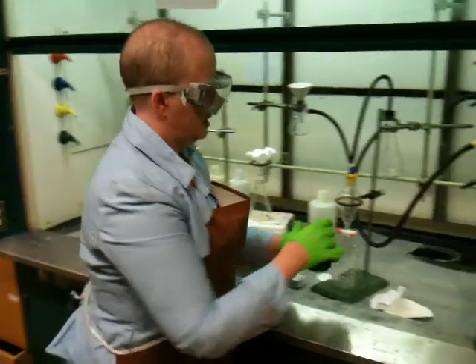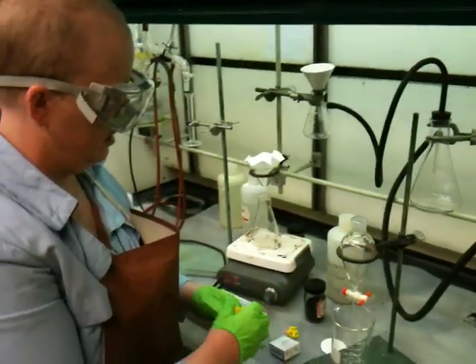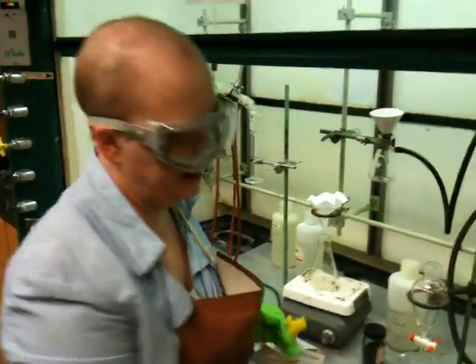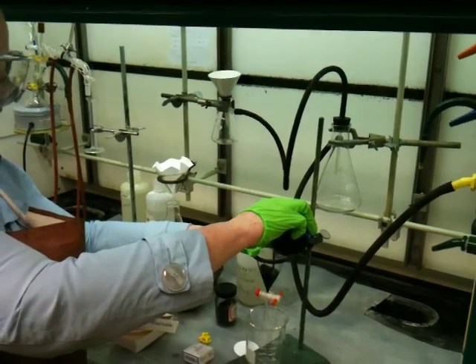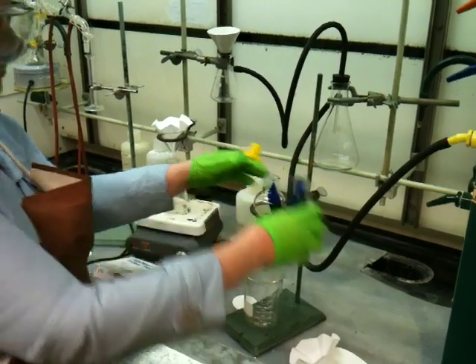So what I want to do is pour this into my funnel. These kinds of tops are made so that you can hold them in your hand and not lay them down on the counter. I'm going to take this and pour it into my separatory funnel. There's actually a lot of dye in this — it's a very viscous solution.